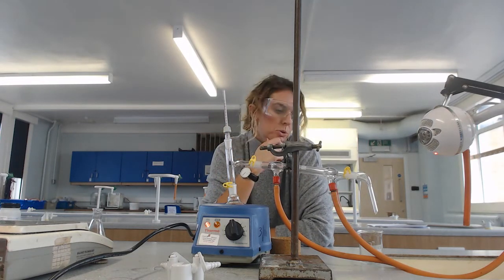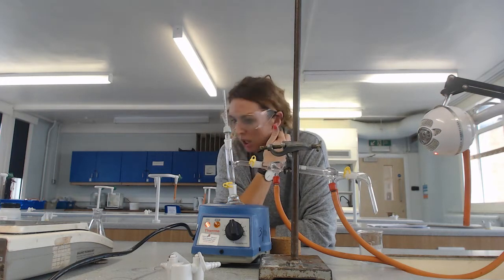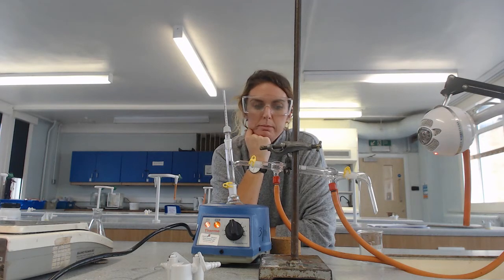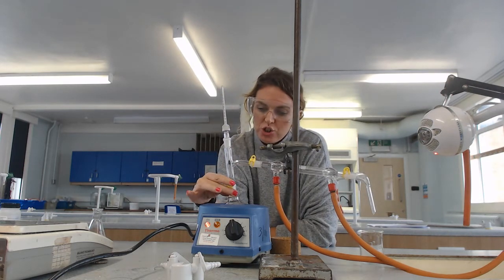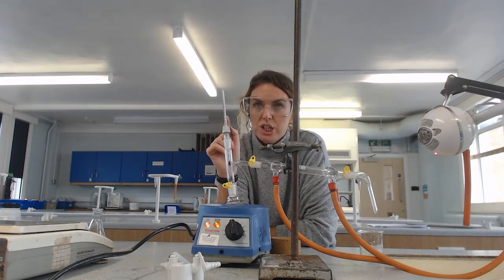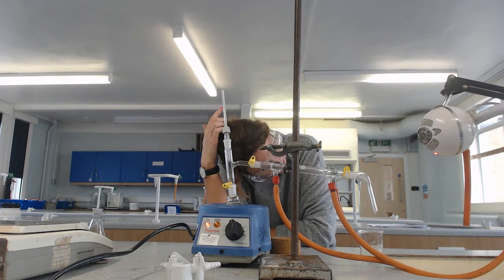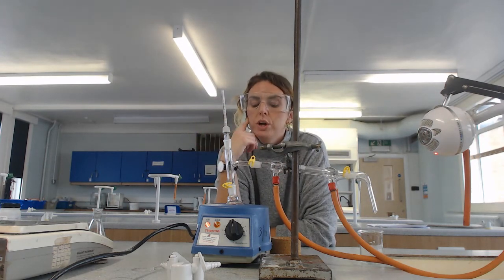If you go on to do any lab-based courses at university, you will use heating mantles much more commonly than at A-level. I'm not going to make you wait until it boils in this video — you just need to make sure you're paying attention to that temperature. It has quite a low boiling point, and once you get to about 55°C you need to turn it off, because otherwise you're getting into the boiling point range of any possible impurities.